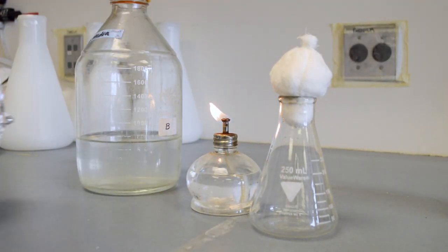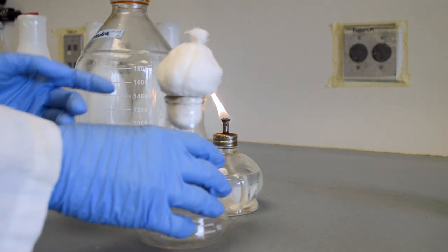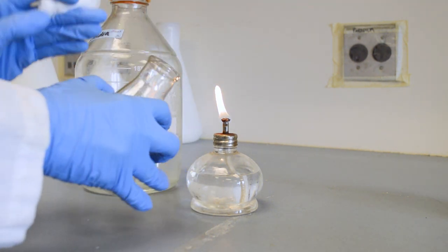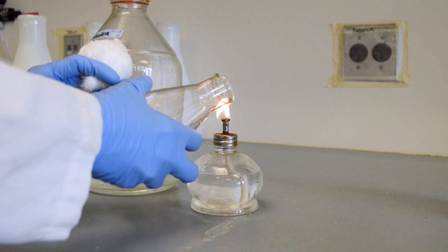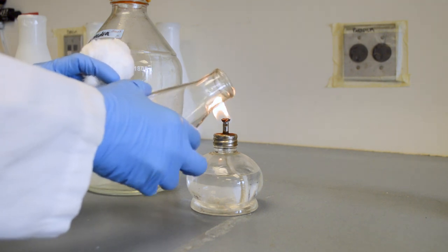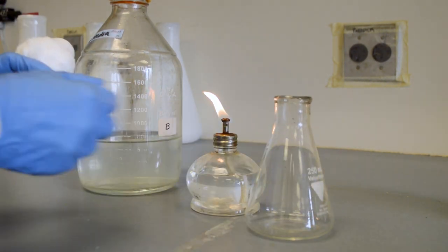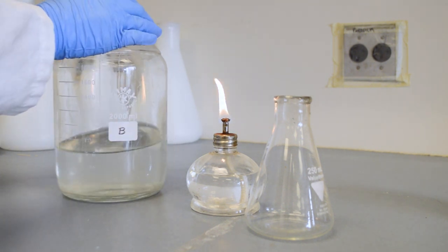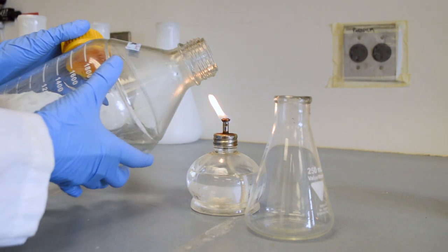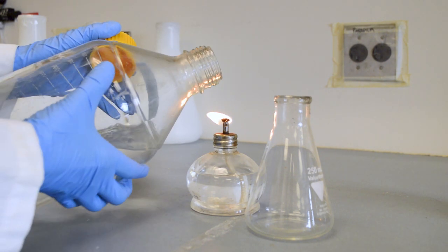Next remove the cap and stopper from your flask. Once removed, flame the opening. You want to place the flask close to the flame and be careful not to move anything above its open mouth. Set the flask down and then open the media bottle. Before we pour the media into the flask, we want to flame the opening of our media bottle as well.